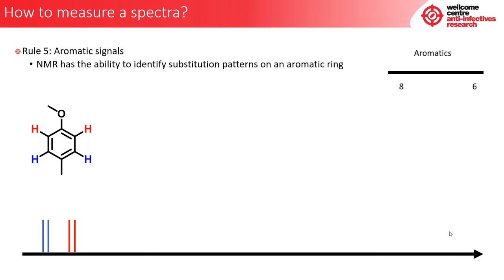Here we have started to add on some groups. So here we have a methoxy that we learned before was electron donating, so it feeds electrons into the ring. A methyl group, a carbon, is virtually neutral, so it doesn't take, but it has the option to give, but just a little bit. And we found out if stuff wants to give electrons into the ring, the positions that are most affected are ortho, signified by O, and para. And therefore what we see here is the site that is most affected, because the oxygen is more electronegative than the CH3, the position that would be the most affected are the protons signified in red.